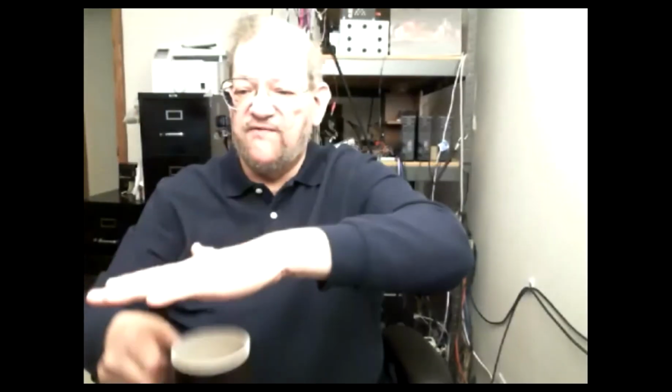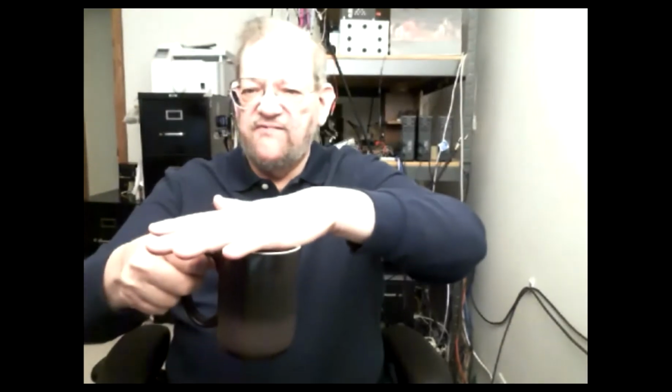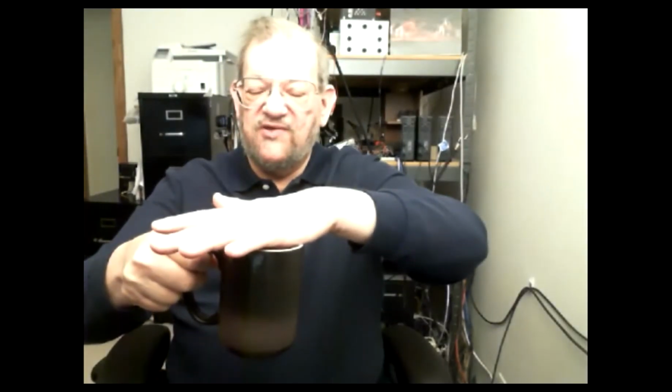Now, in the video, and they show it, it's a good home thing. If you're cooking at home, assume this is a frying pan. Whenever I do any frying, I have a larger cover that can fit over this and totally cover it. If you ever have a fire like that, the quickest thing is to cover it to stop the oxygen from getting there. And luckily, I've never had one, but when I work with dangerous things, I assume the worst and be prepared for the worst. So if something does happen, I'm ready.